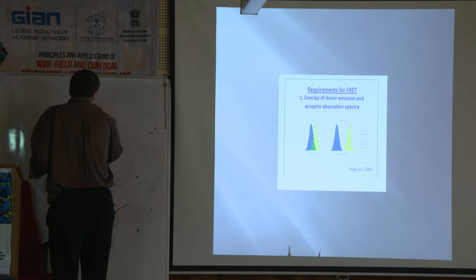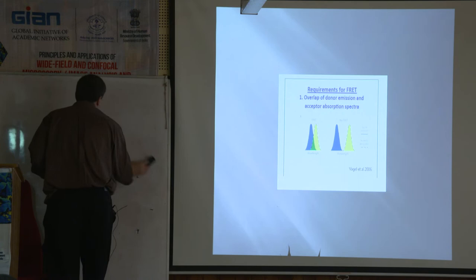Okay, now we talked about this a little bit the other day, and there seemed to be a little confusion. So I'm just going to go over the idea of how you make these fluorescent proteins real quick.